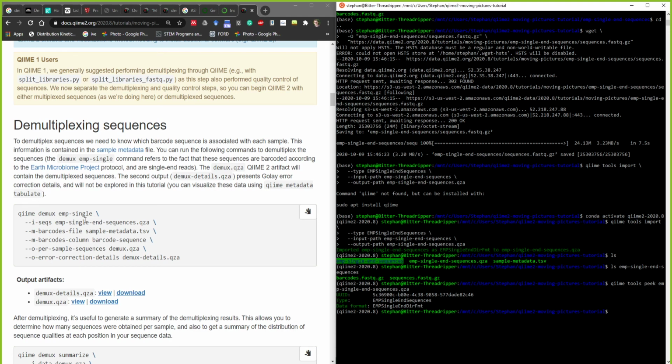Which directory do I go in? You're going to want to be in the QIIME2 moving pictures tutorial directory. Okay, cd. And I wonder if tab completion will work for you. I'm not sure. I was trying it, it didn't do it. Okay, but it might. I think we might end on how to set that up. It's going to be very helpful. Okay, so once you're in the directory, let me know, and we'll go from there.